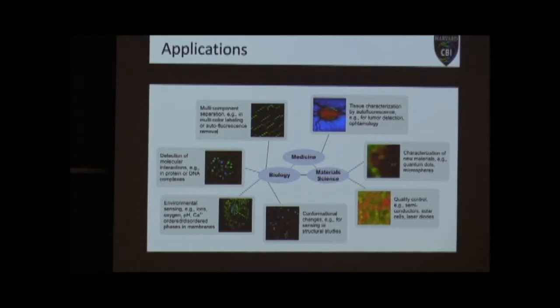So that's the hardware and how the system works. So what do we actually do with this? There are a number of different applications that fluorescence lifetime imaging has been used for. If any of you have done multispectral imaging or linear unmixing on our confocals, so if you have some autofluorescence in your sample that you're trying to get rid of, or you're really packing in a lot of dyes and you've got some bleed-through between those dyes and you're trying to separate them out, you can essentially do the same thing with fluorescence lifetimes. As long as each of those dyes or your autofluorescence have a different lifetime, you can bin that out. I'll show you an example of this a little bit later.